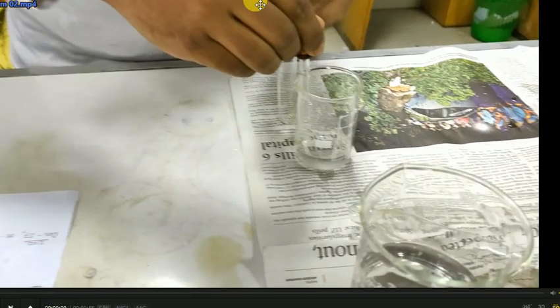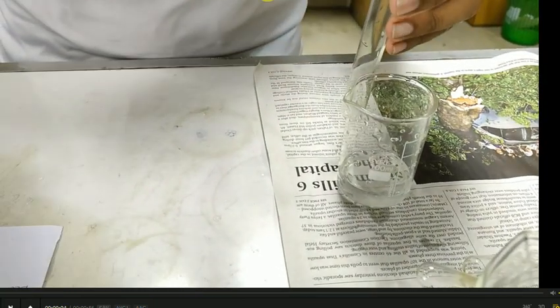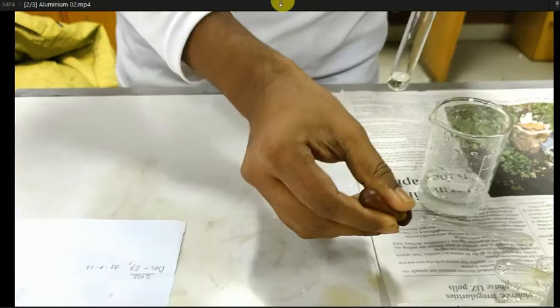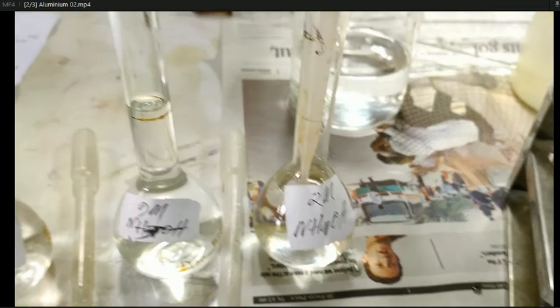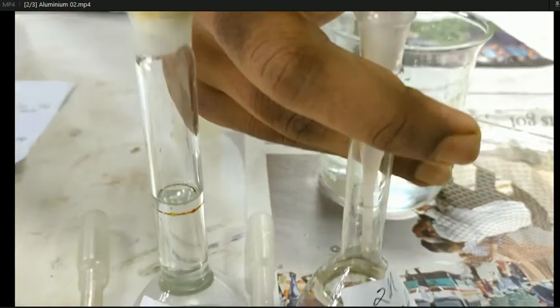We are taking the sample solution again, 1 ml sample solution in the test tube. Into this sample solution, we will add dilute ammonia. This will produce white precipitate, and in this case the precipitate will not dissolve.